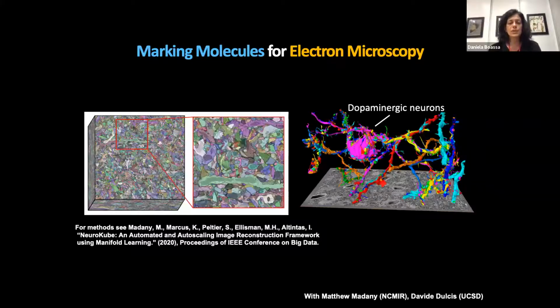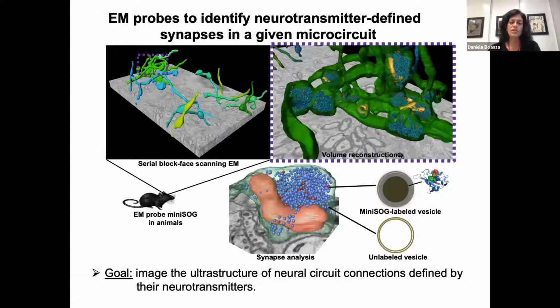These tools allow us to obtain nanoscale maps of all cells and tissue, but one challenge is the ability to differentiate different cell types in complex tissue based on key molecular constituents. And so we work to achieve this goal, and today we can introduce specific EM reporters to differentiate cell types by EM or to target proteins within specific pathways to assess their location and function. And so I'm going to show you an example of such an application.